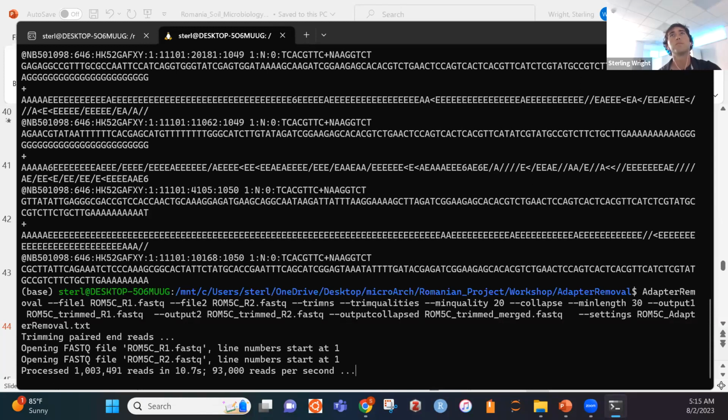But even though that's a lot, usually a basic laptop can finish this sort of analysis. So we've got 3 million reads. Looking back, I probably should have done this before and then talked about what each option is doing. That's okay.